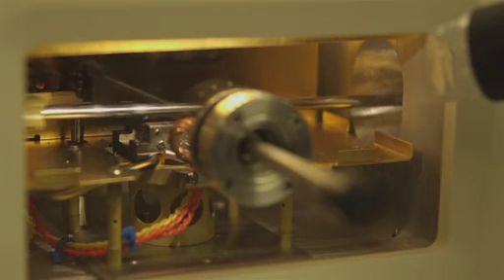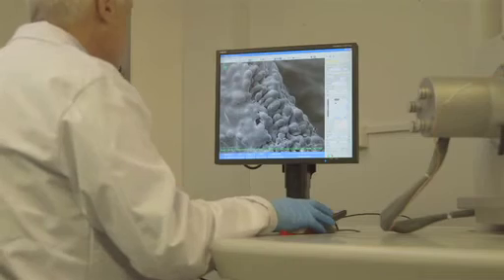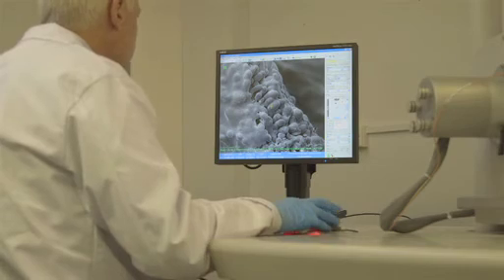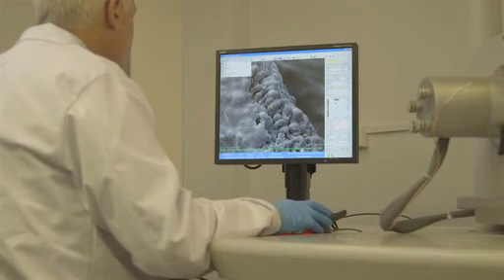The microscope gate valve is opened and the specimen is transferred onto the cold stage of the microscope for observation.